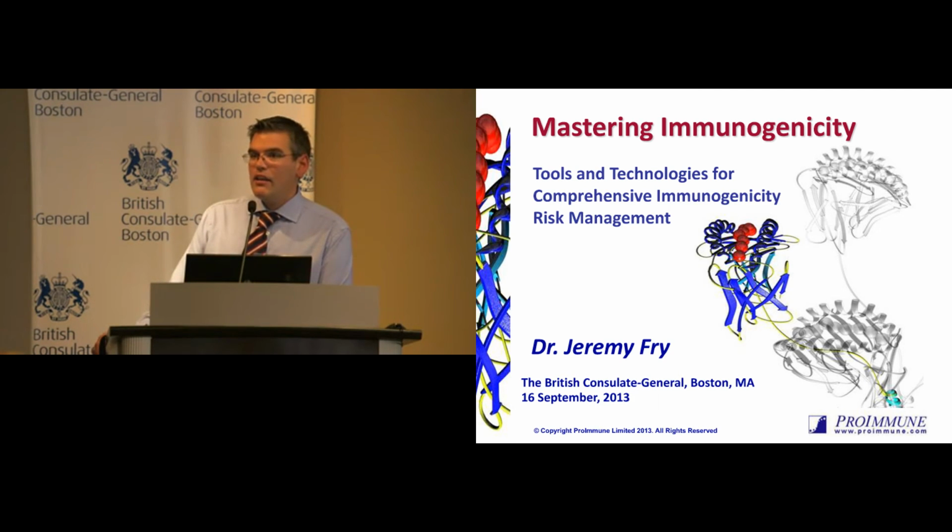And the question, I think, relating to different levels of clinical immunogenicity, it does come down to the fact that what this assay, in our opinion, does is tell you about T cell epitope content and not about what that clinical immunogenicity correlation is. And that's very difficult because, as we've just been slightly disagreeing earlier, it's very difficult to actually know what that data really is and what those values are. So for us, it's a decision tool to be used along the road in understanding which molecules to take forward on the basis of having a relatively lower T cell epitope content. I don't know if that 100% answers your question relating to the DC-T cell assay.